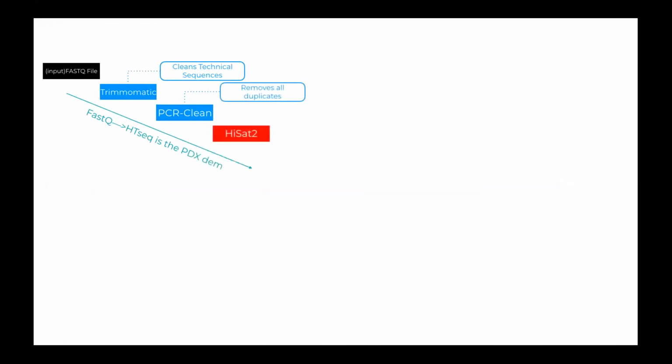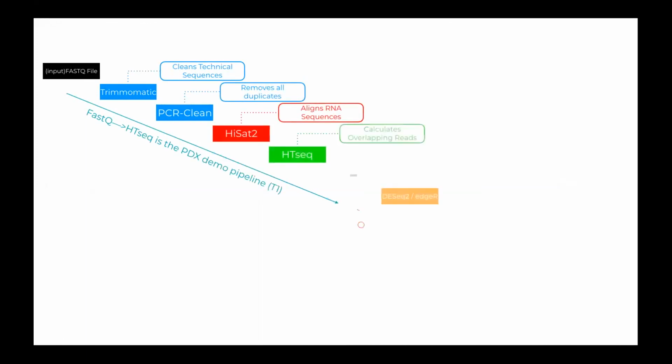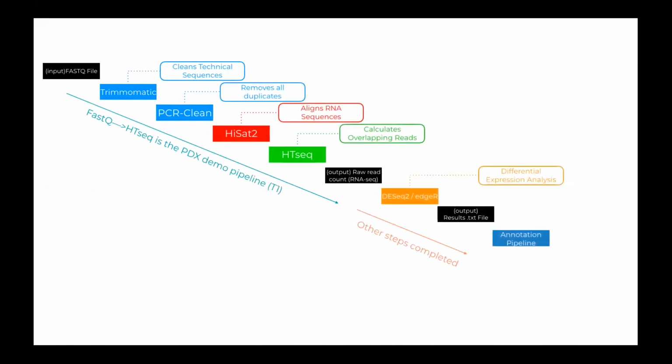Before we get into today's material, I wanted to recap a few concepts from the last lesson. Recalling our analogy, analysis of RNA-seq data is like a pipeline. Imagine data flowing like a river, a downstream river, flowing from the top to the bottom.